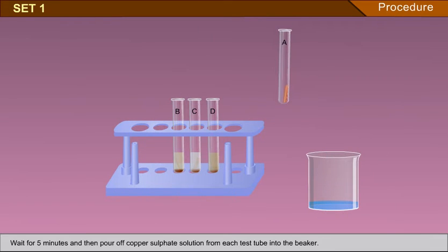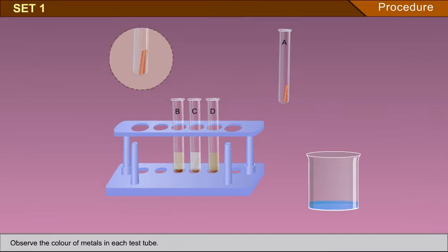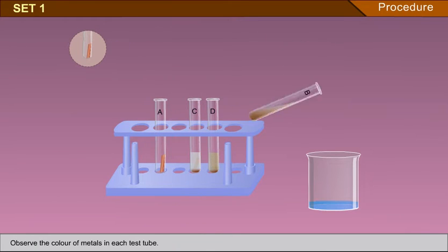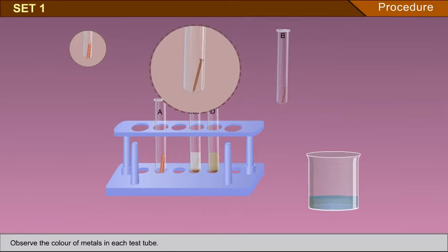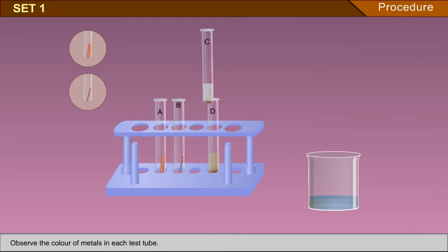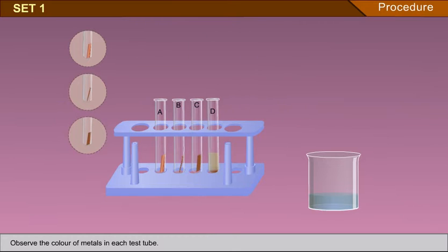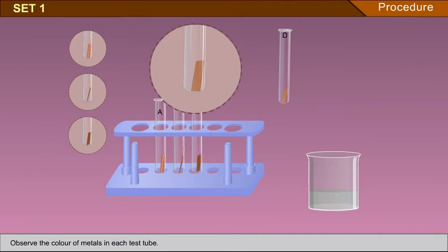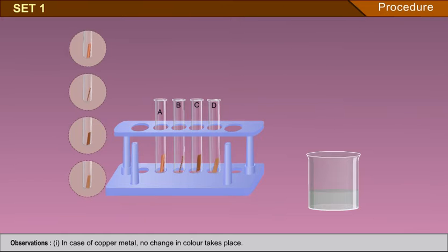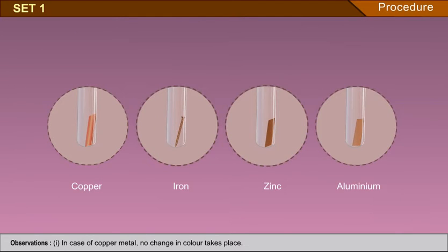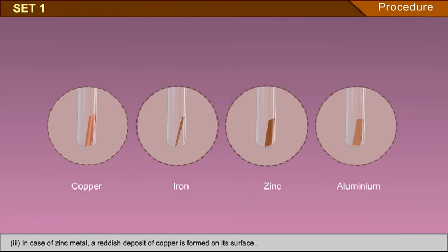Observe the colour of metals in each test tube. In case of iron metal, a reddish deposit of copper is formed on its surface.